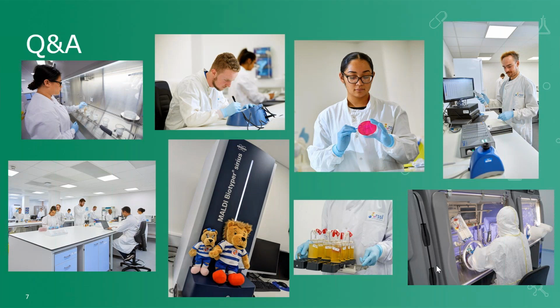Okay, I have a question from Scott, who says, can you comment on how to model media fills or aseptic process simulations related to scale? And do they have to all be done at full scale, or are there reasonable guidelines to be able to downscale the process for this type of testing? So unfortunately for media fills, within all the GMPs issued, it directs us back to Annex 1.